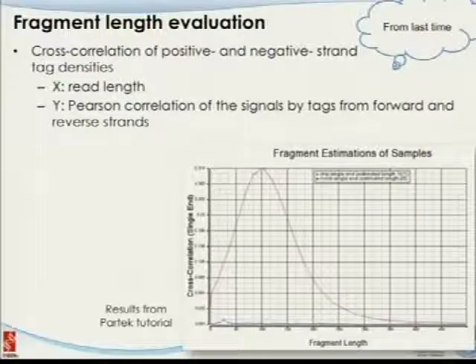And so people try to decide that initially just experimentally. So they got the gel pictures and they run the gel, and then they cut the band, and they decide what's the range of the DNA fragment that has been used. But that is not really perfect because you don't really get the distribution of things. And we also mentioned that later PCR steps may favor shorter fragments rather than long fragments. So what you derive in the final sample probably is not the same as what you see on the gel picture. So people decided to do that computationally.